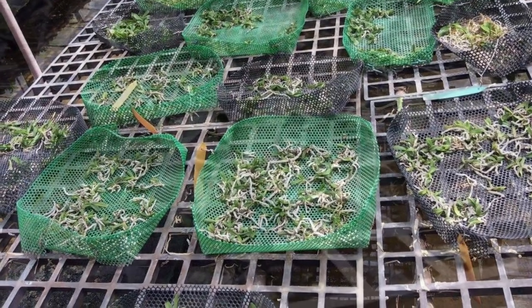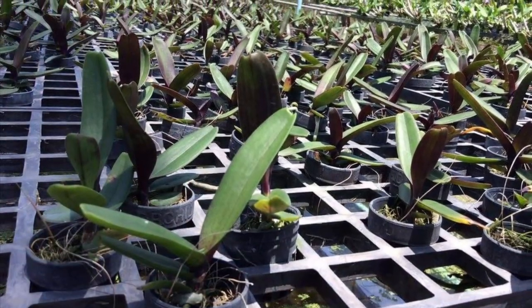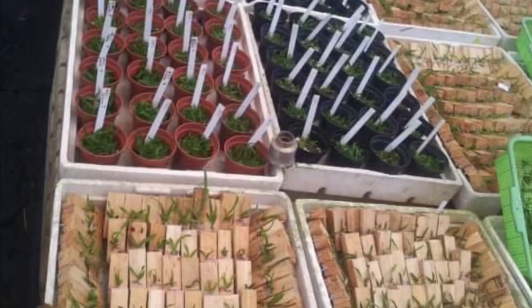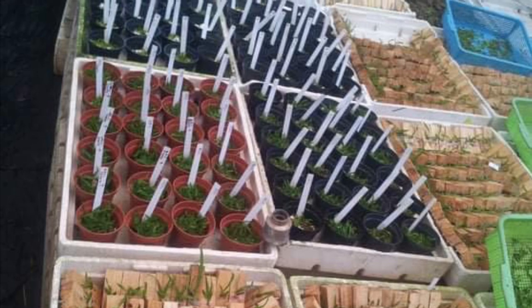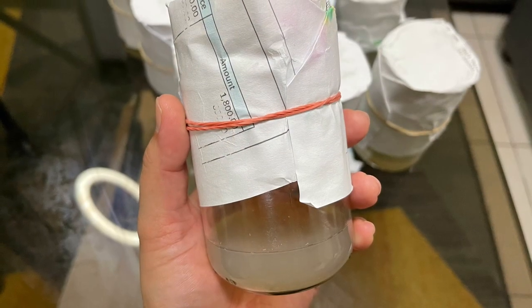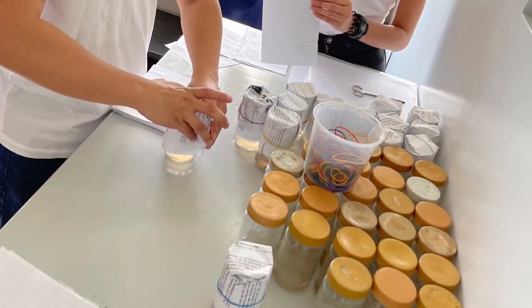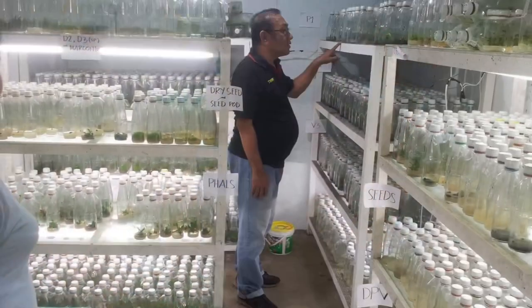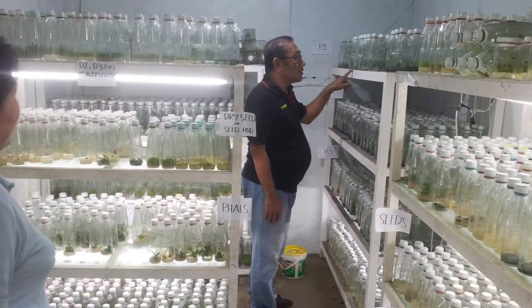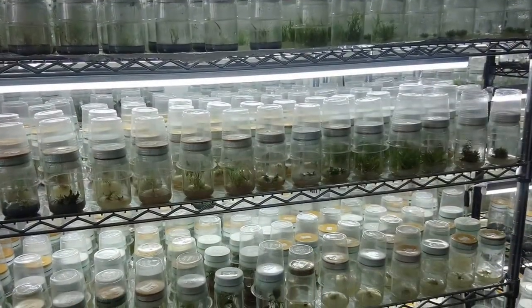Out of thousands and millions of seeds, only a few survive and grow to maturity. Science has demonstrated that mature orchid seeds may be grown in artificial media, and this is the most viable way to ensure survival of most of the seeds. Growing seeds in artificial media is the most effective way orchids may be grown for conservation.